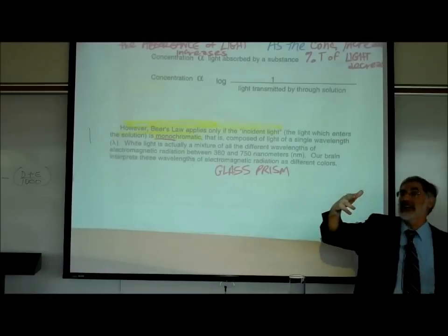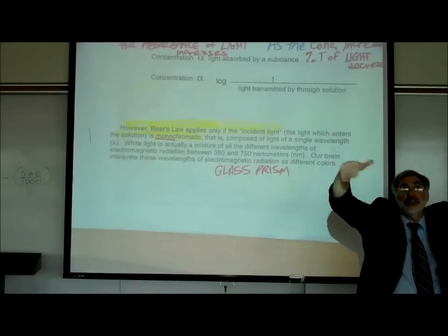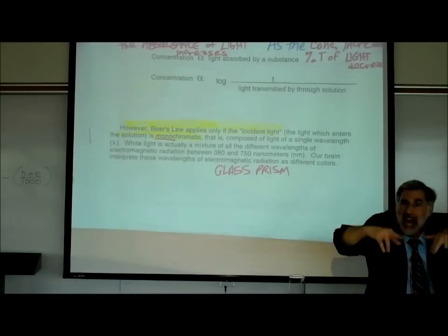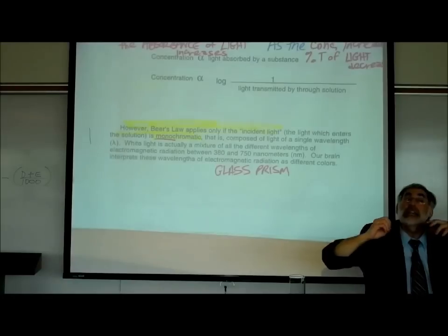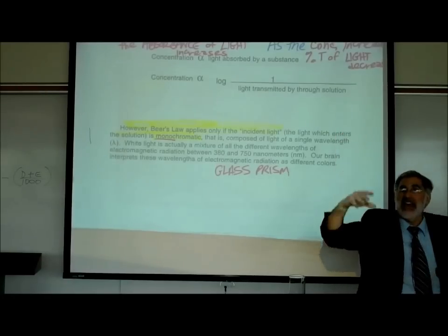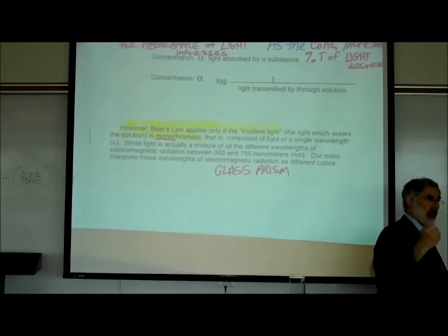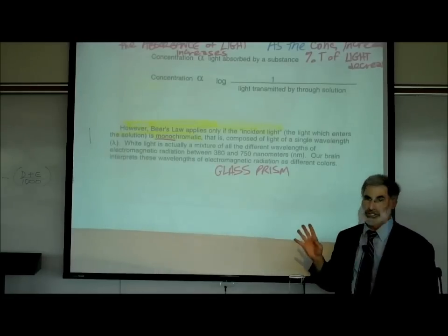And then, interestingly, when these electrons that have gained energy and are in a different energy orbital level drop back down to their lower original orbits, they release light energy, and that's called an emission spectrum, right? So there's an absorption spectrum of certain wavelengths of light and an emission spectrum.